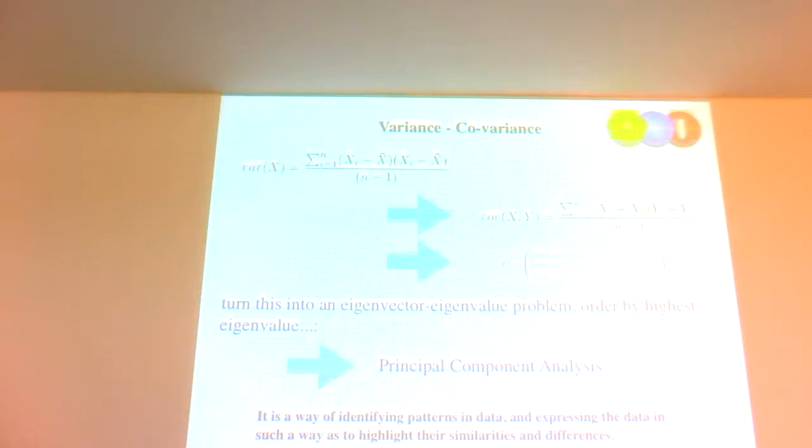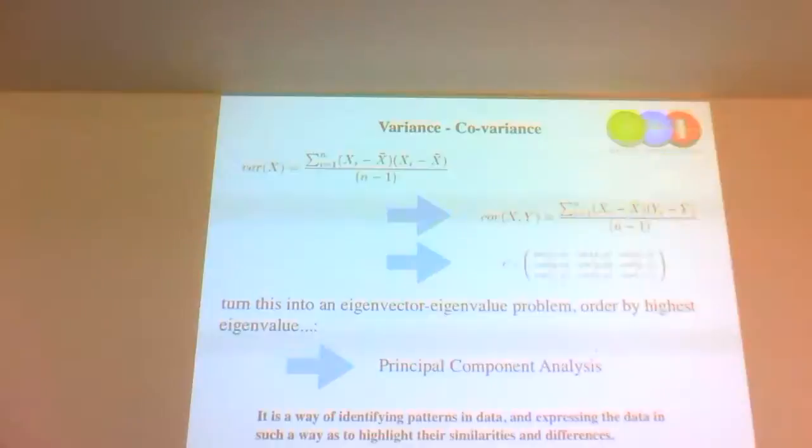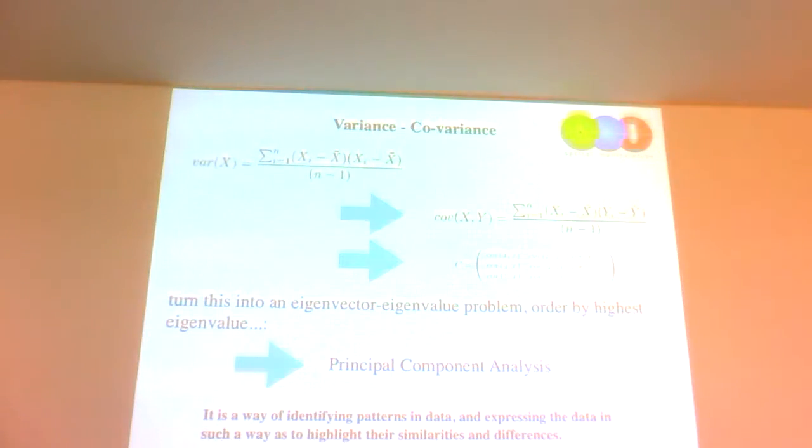Karl Pearson came up with this in 1905. It's been around. Now, let me tell you, I think PCA is one of the most amazing things in the world. I really think so. We would not believe what we use it for. I'm going to show you an amazing example of what we use Raman and fluorescence and PCA for at the end of this talk. But I think it's an incredibly powerful route.